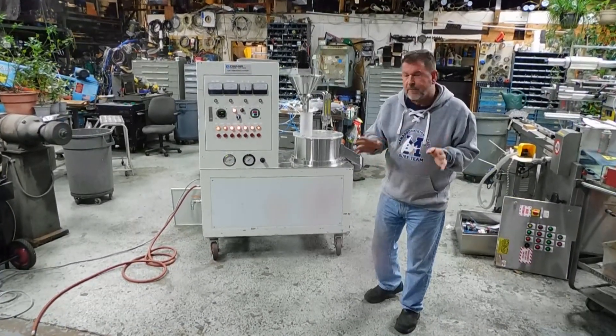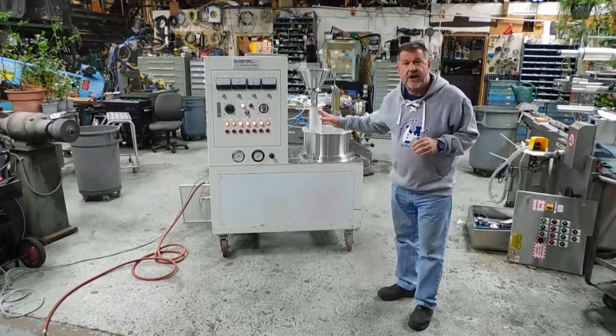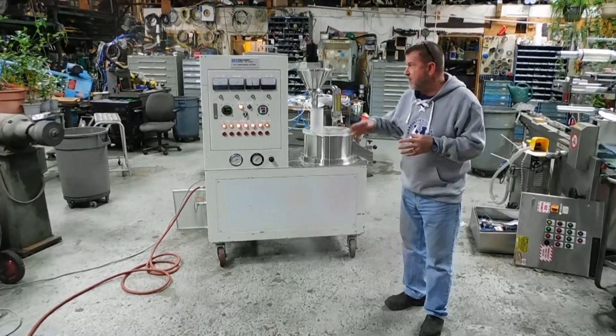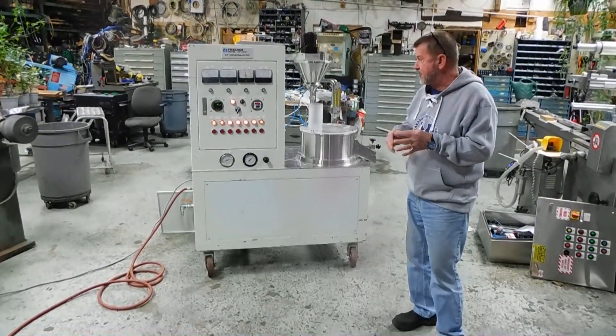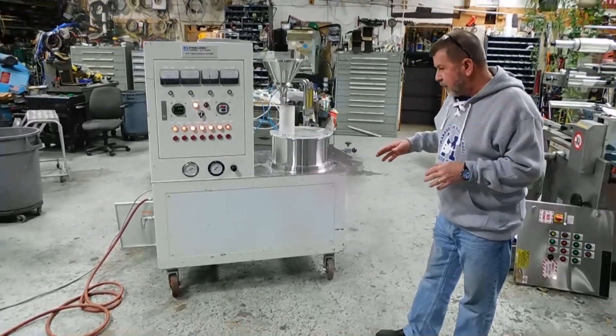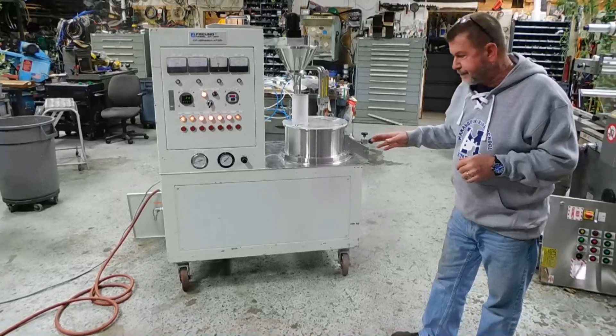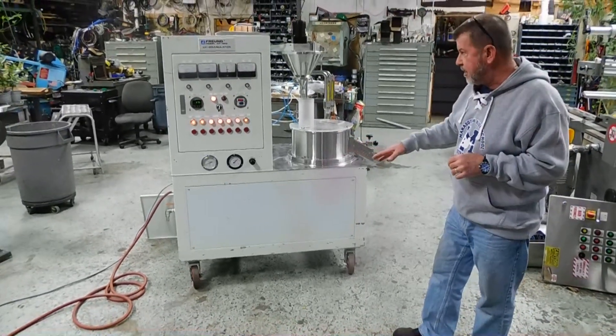Hi everybody, we've been asked to do a demonstration of this spray granulating machine by Freund. It's part of Vector here in the United States, Freund is the Japanese manufacturer. We're operating on 220 three-phase voltage right now. We have air supply to the unit.